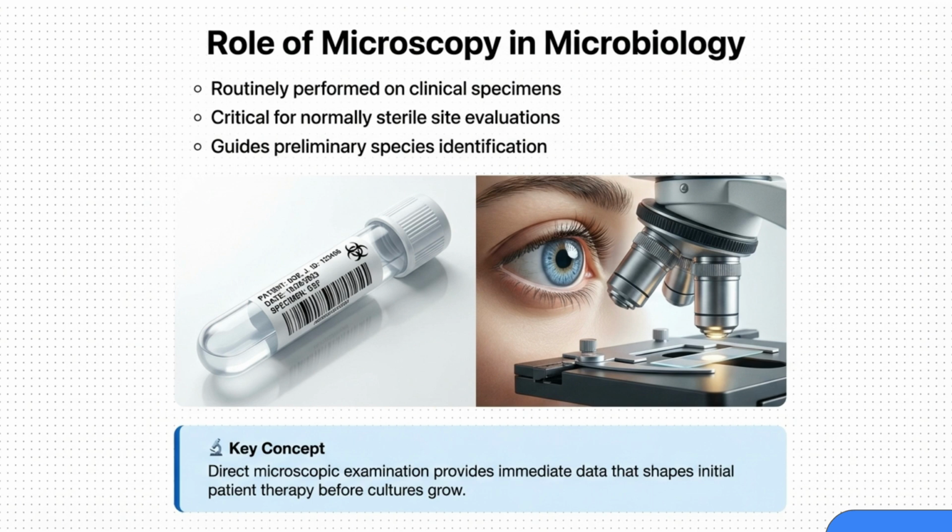Microscopy is a critical routine step in microbiology, especially for evaluating normally sterile sites. It guides preliminary species identification, providing immediate data that shapes initial patient therapy before cultures fully grow.